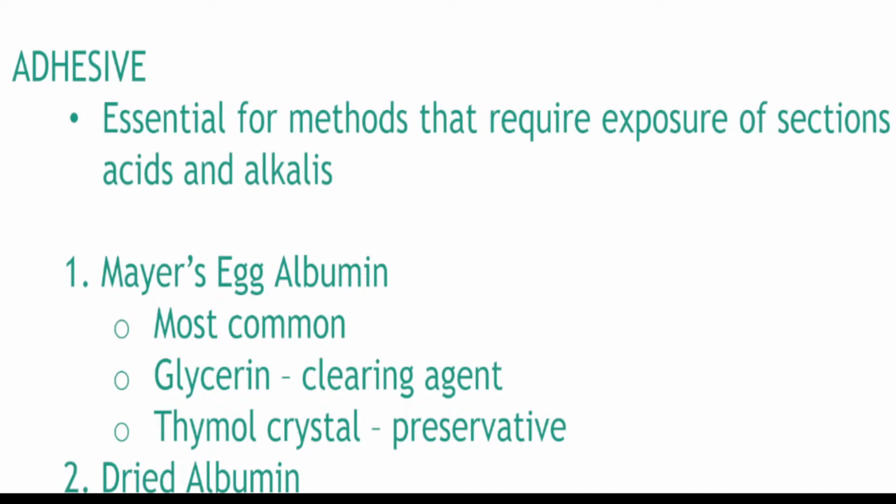So Mayer's egg albumin is the most common. Glycerin is a clearing agent, not the clearing agent we talked about earlier, but a clearing agent to prepare the media for mounting. Glycerin is there to make it slippery, so it mixes quickly with the mounting media.